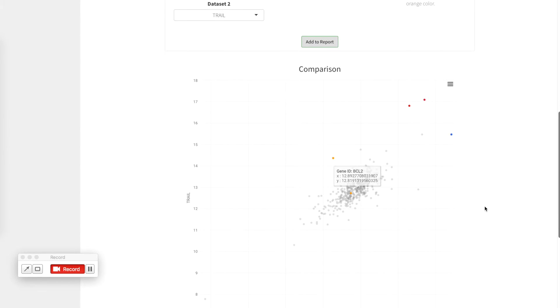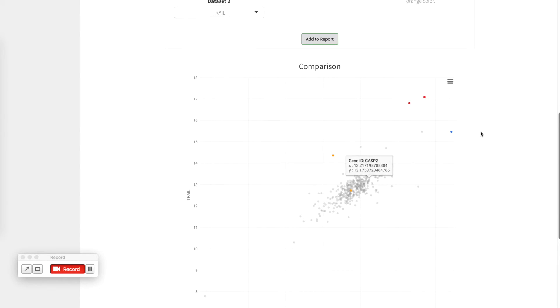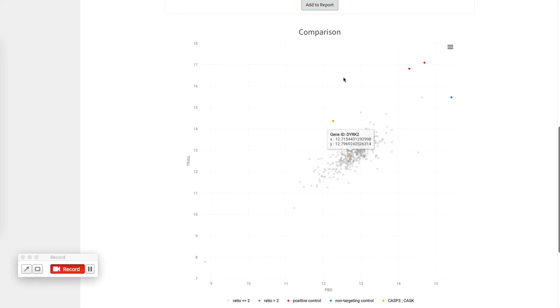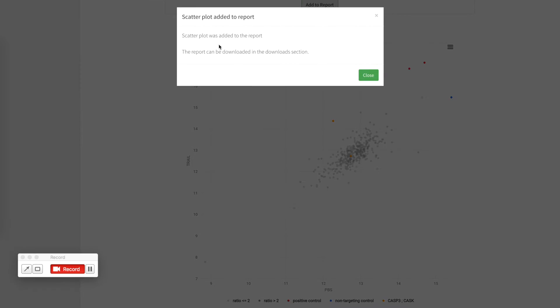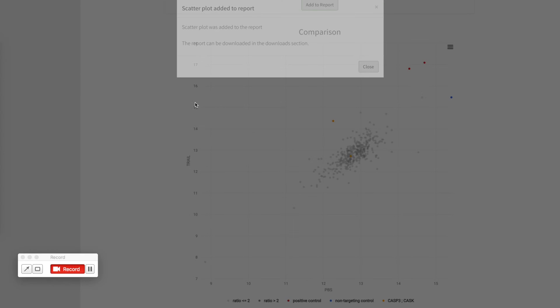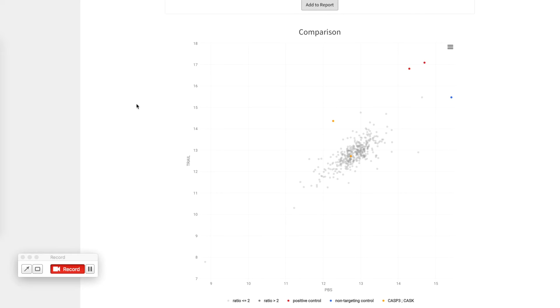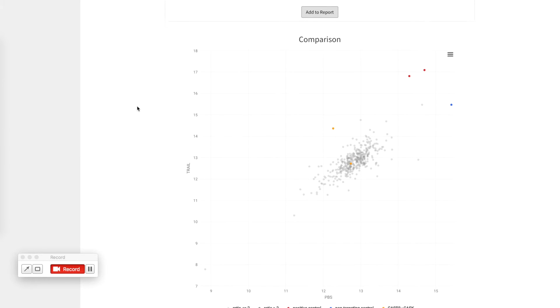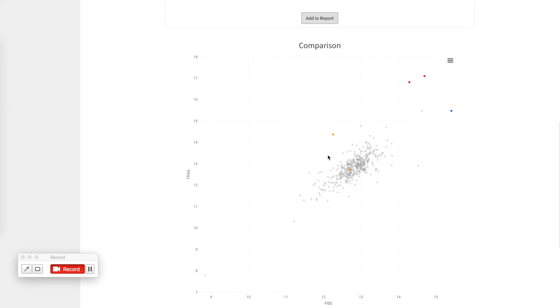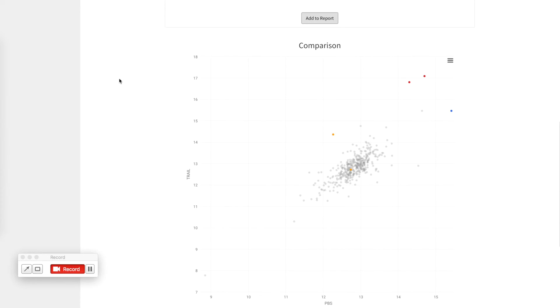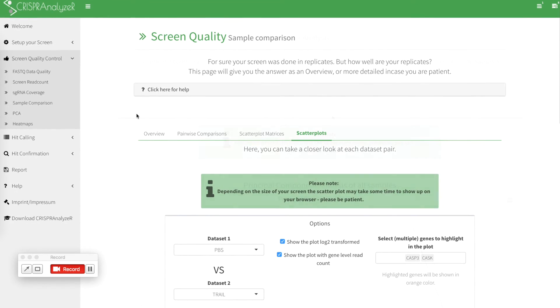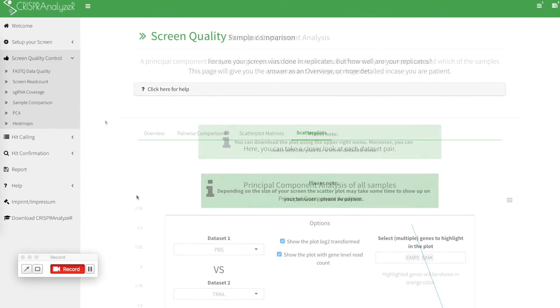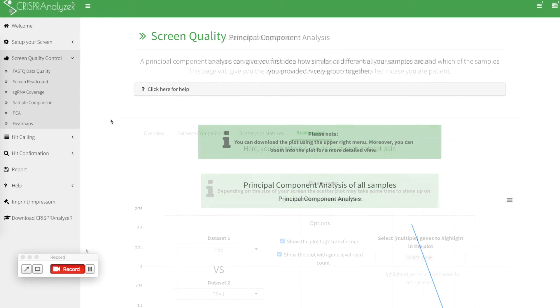Once you have changed something here, don't forget to click to add to report to really add this individual report that you have just created. Add this plot to your report. You can add multiple plots if you like. And once you have changed things here, hit the button and it will be added to the report.